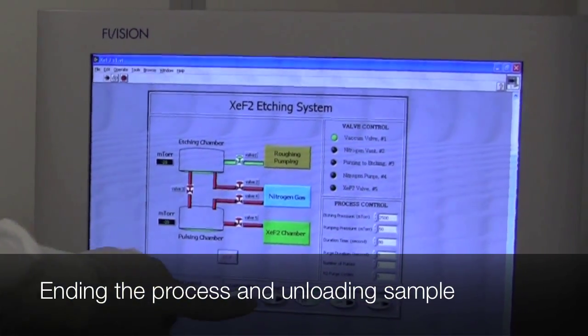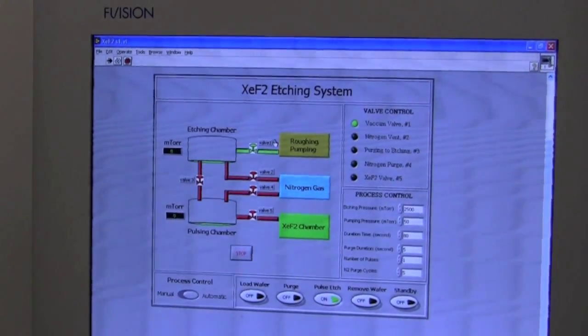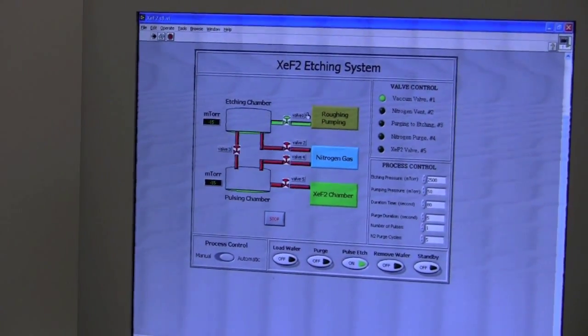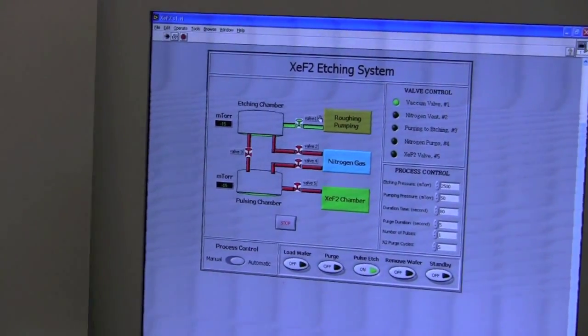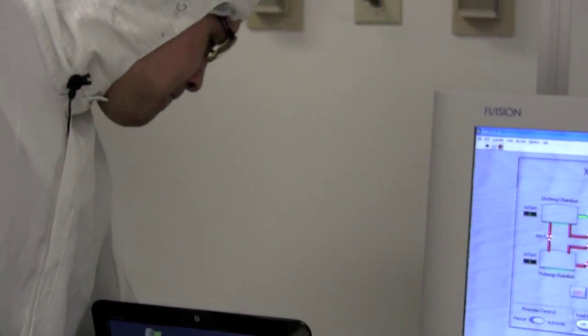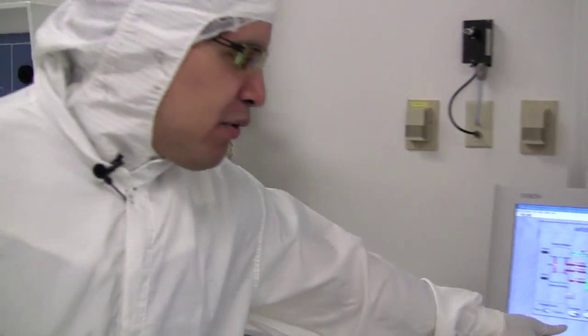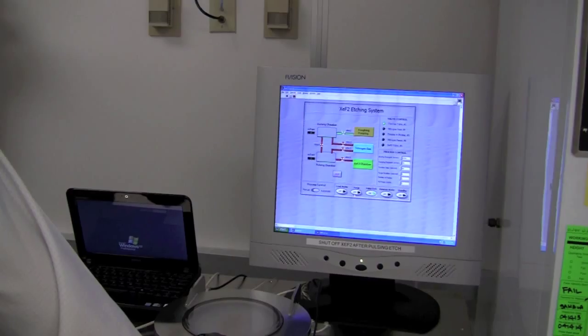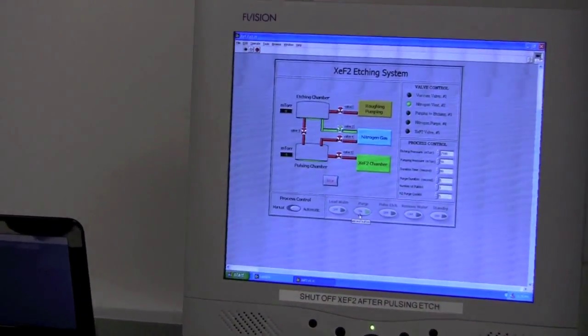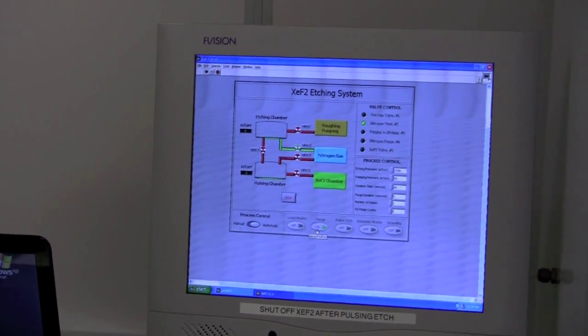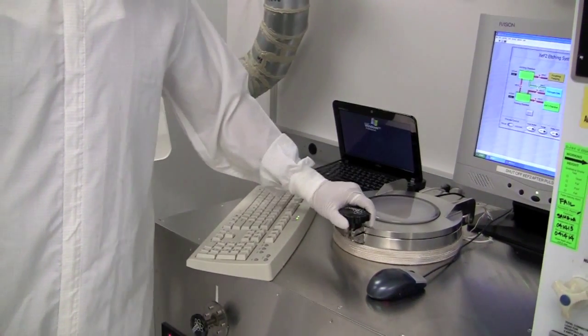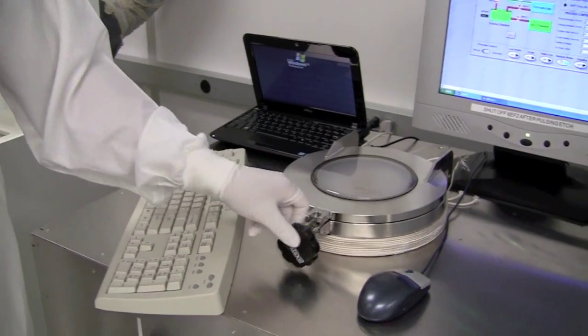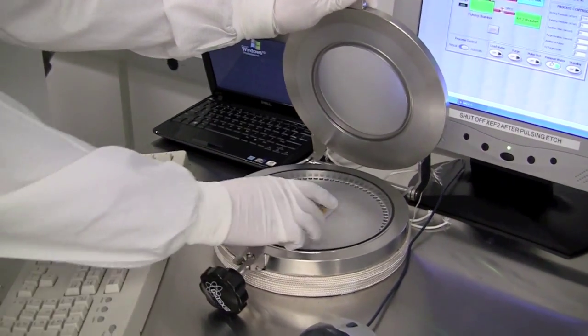So now our pulse etching routine is done. As you can see, the buttons are now solid again, and we're ready to continue our process. Before we do anything, we want to make sure that bottle behind the chamber is closed. Once the bottle is closed, you want to hit purge again. So we'll hit the purge button, and this will purge the chamber of any xenon difluoride gas that might be left over from our reaction. When your sample is done venting, go ahead and unfasten this again, and open the chamber, and take your sample out.